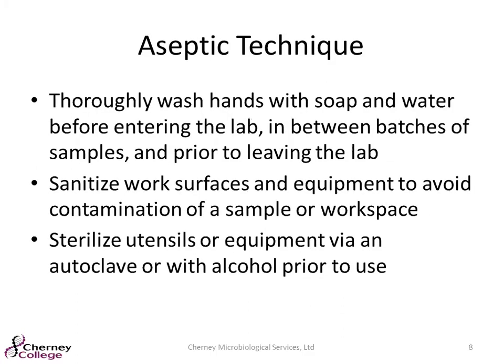So you want to make sure you thoroughly wash your hands with soap and water before you enter your lab, in between batches of samples, and prior to leaving the lab, and make sure that you sanitize all work surfaces and all equipment to avoid contamination of the sample or the workspace. And then sterile utensils, or having the appropriate means, whether it's autoclave or alcohol and flame, to make sure that they're sterile in between testing.